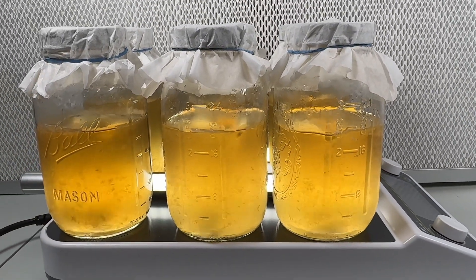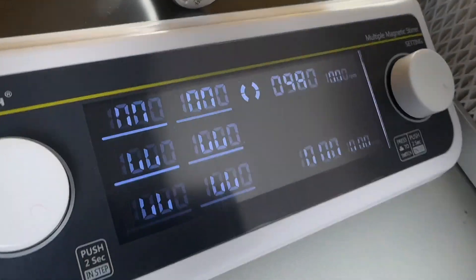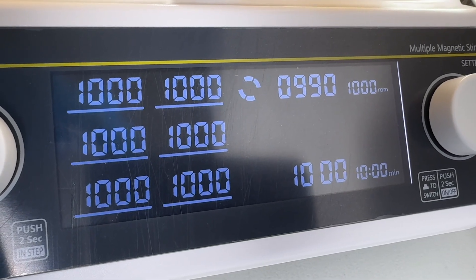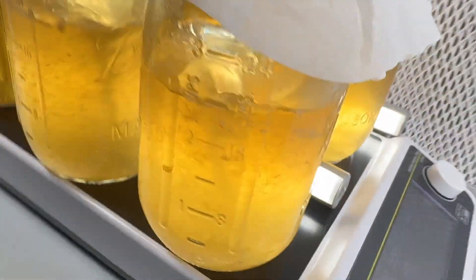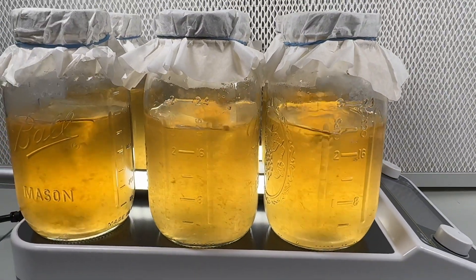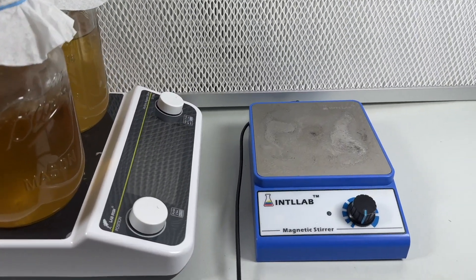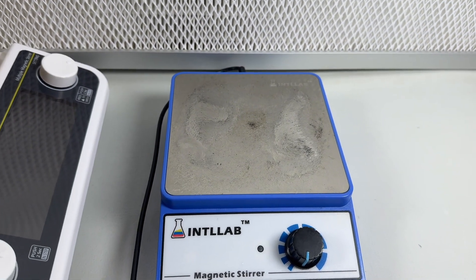After a few days of testing it out, it works amazing and it's exactly what I needed. I have thousands of mushroom liquid culture jars that need to be stirred every so often to break up the mycelium and prevent it from growing on the surface. So having this six-position magnetic stir plate makes it a lot easier than using a one-position magnetic stir plate to get all of those jars done.